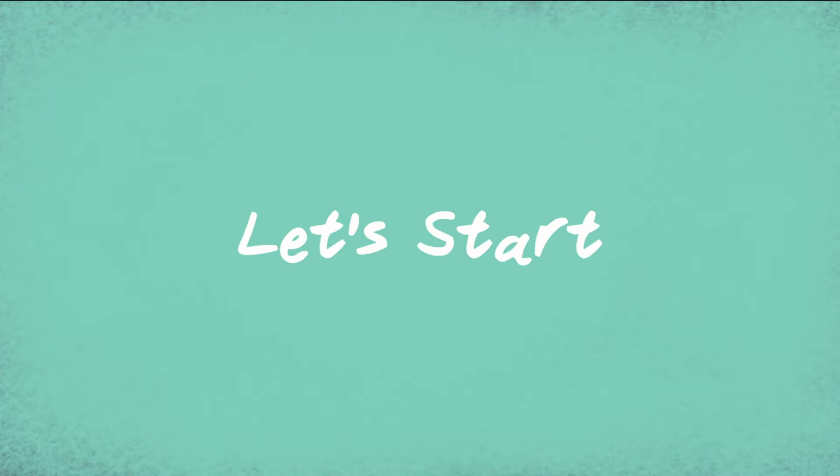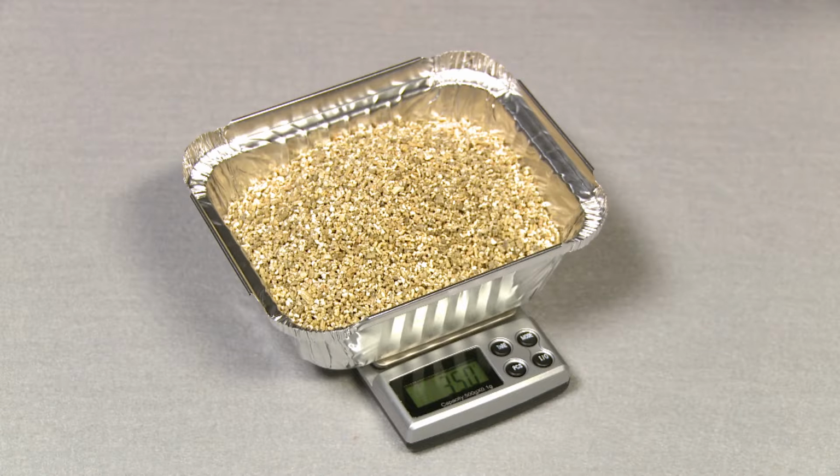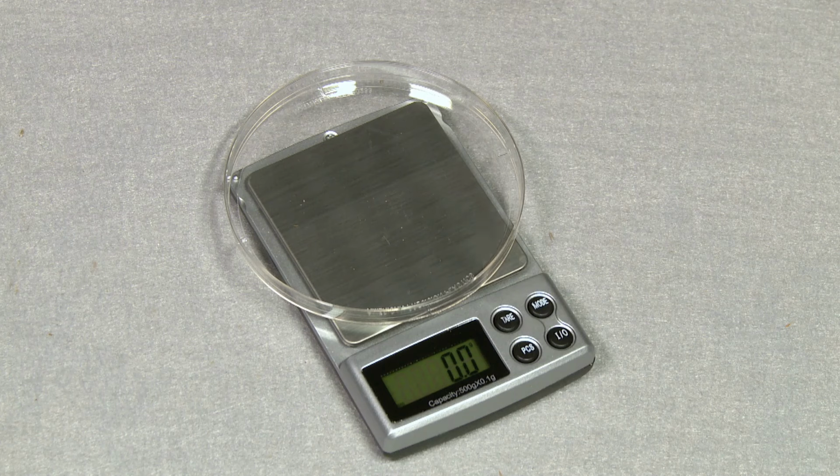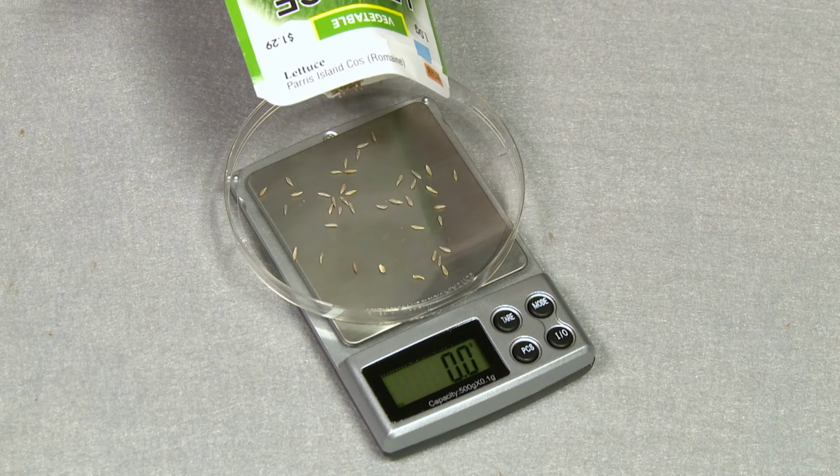Let's remember how we planted our seeds. And I won't say that I dig this part. We started by weighing our vermiculite, which we used as our soil. Then we weighed our seeds. We've made sure to weigh everything, vermiculite and seeds, to fully understand the mass change.